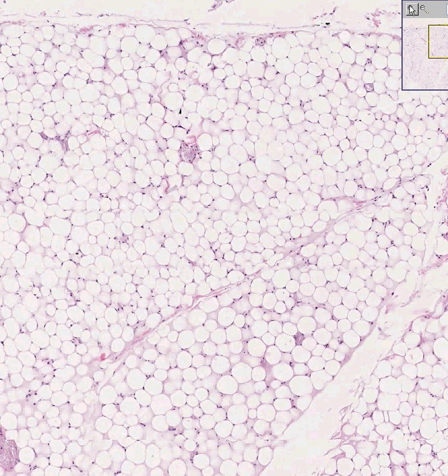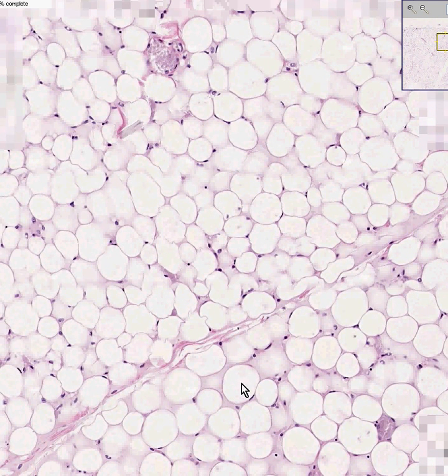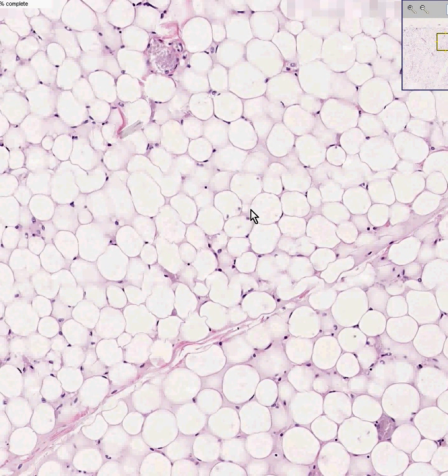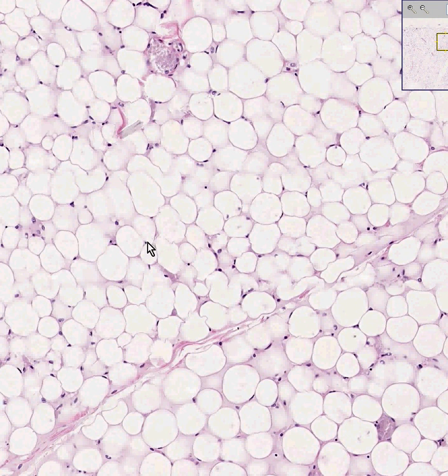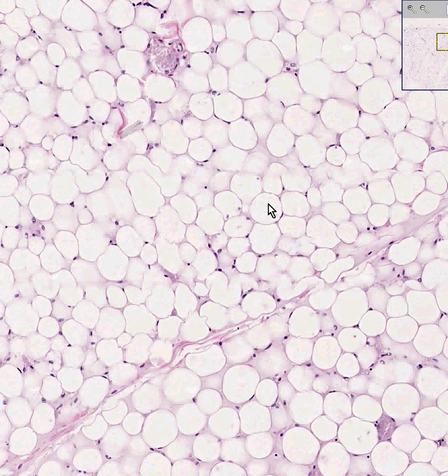Let's zoom in a little bit more and nail this thing down. The reason why fat is so clear is because in the process of tissue processing, there's a stage in which the tissue gets passed through fat solvents, and the fat — the mature fat — gets washed out. That's why these are all wide open spaces, because the tissue, chiefly neutral fat, is gone.